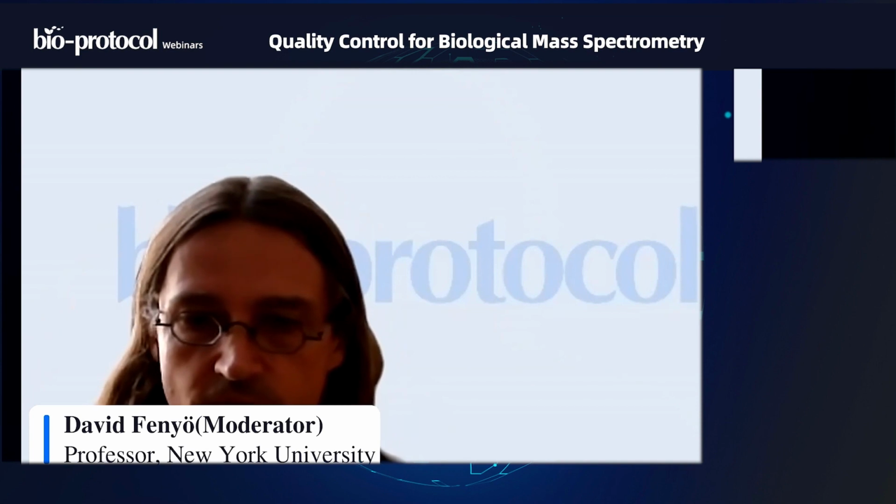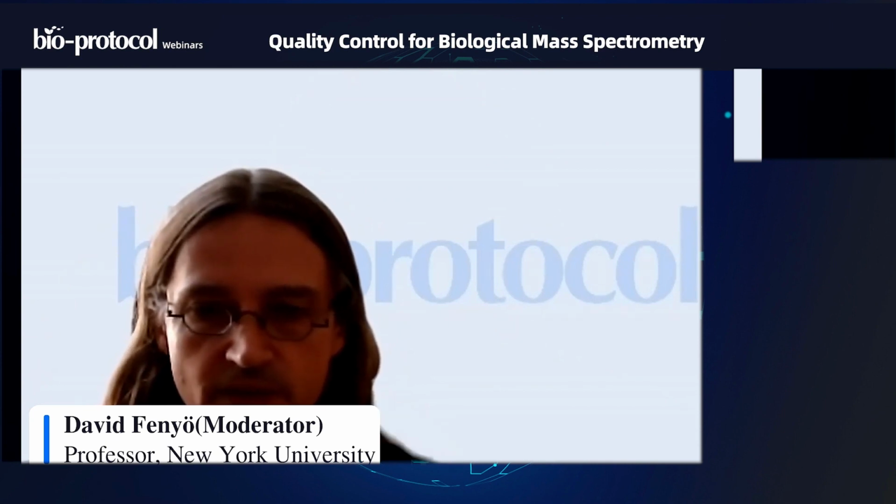So let's see. There's another question about FDR, and that people often use 1% for reporting identifications. Do you want to comment on that? Be happy to.